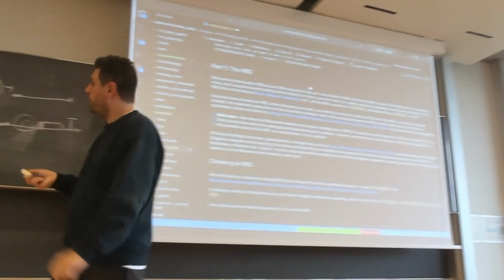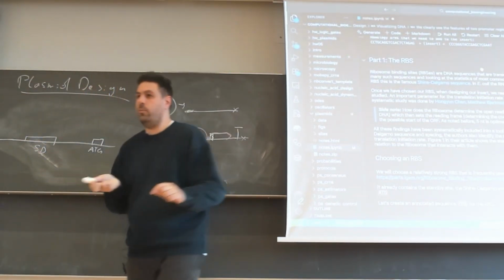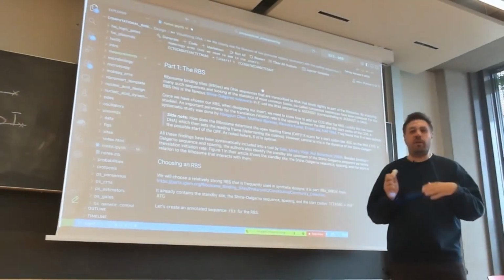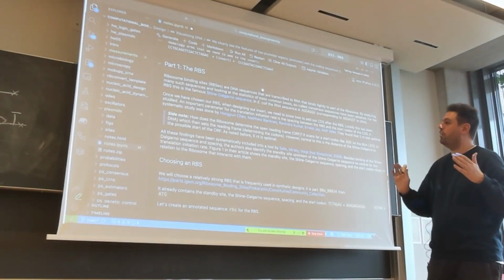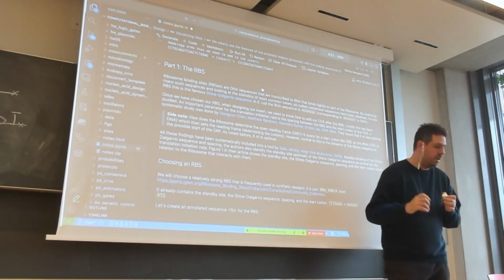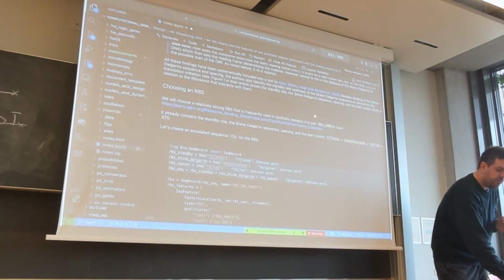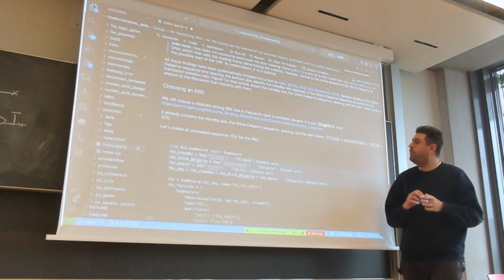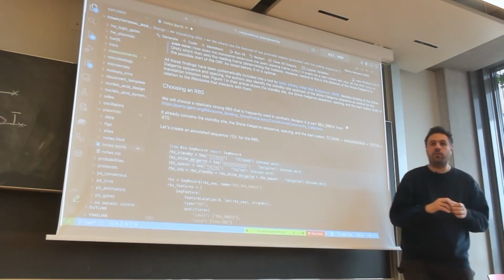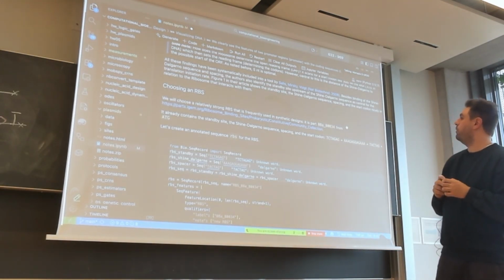First, it's typically not a very good idea to take exactly this sequence, because it is super strong. Fortunately, people have done experiments, and there is also a very nice paper about computational aspects of how to do this. We pick one of the sequences that is very well known in synthetic biology. I think it has been used by Elowitz. This is the famous BBa_B0034.